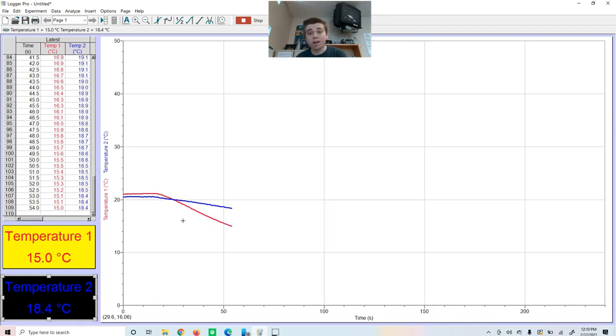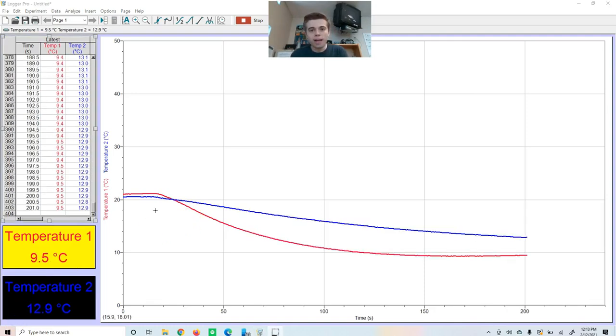I'm going to go ahead and pause the video now and wait for the experiment to run, and then I will bring you back and I'll show you the complete final data for this run. Welcome back. We are almost to the end of our first trial. We only have a few more seconds left, and then I'll run some statistics and we'll be able to record what our maximum temperature is.